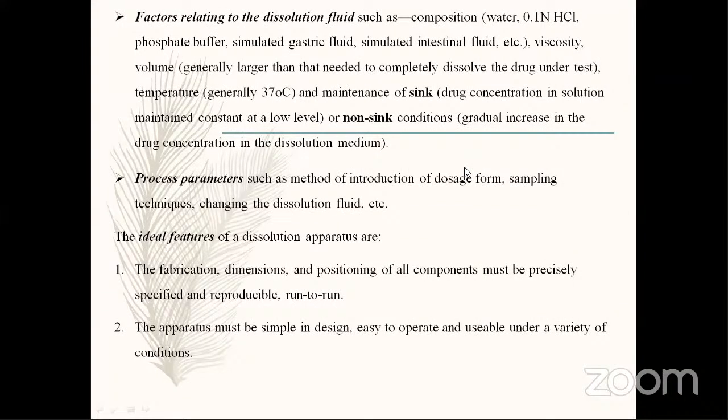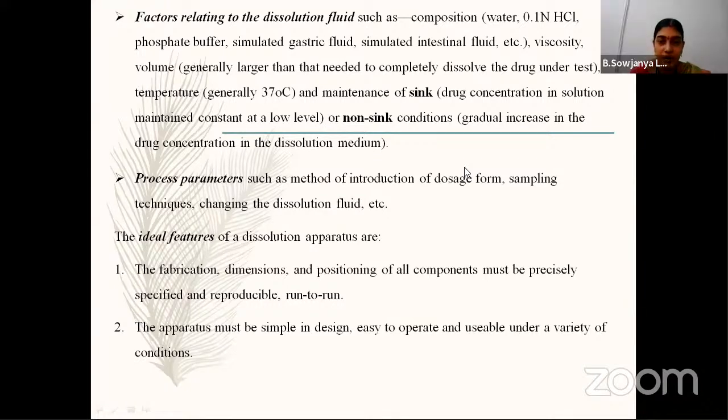Students, are there any questions? How does agitation speed affect the dissolution property, right?